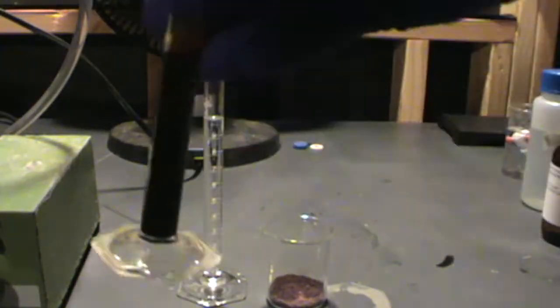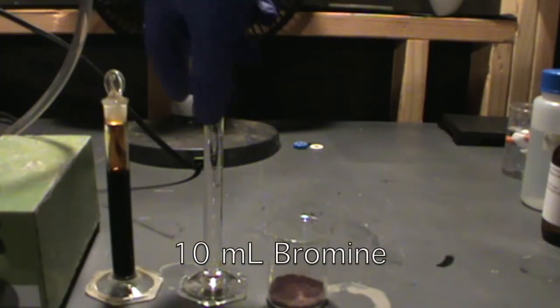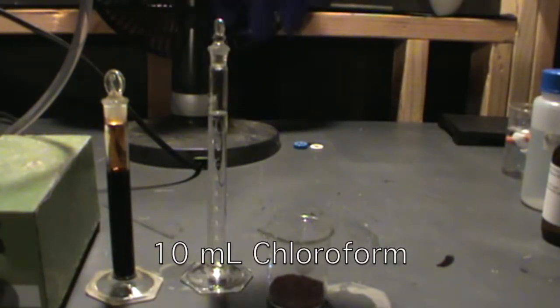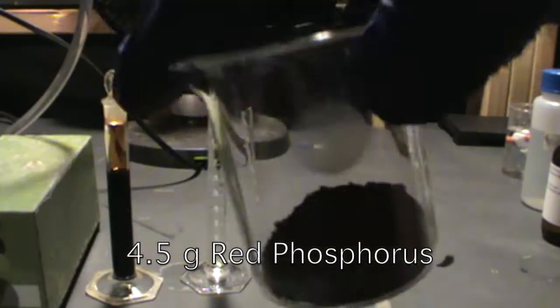For this synthesis, you will need 10 mL of bromine, 10 mL of chloroform, and 4.5 grams of red phosphorus.